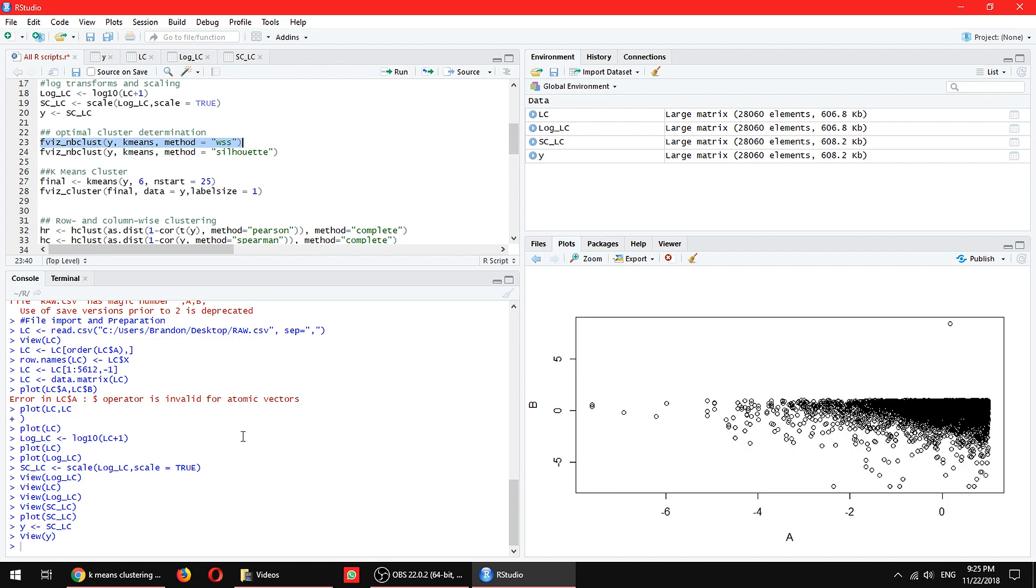As you know, I'm recording on the same day right after my first video. You can actually see all my code are still here, which is what you should have after you finish the first video on how to make my CSV into a heatmap tutorial.